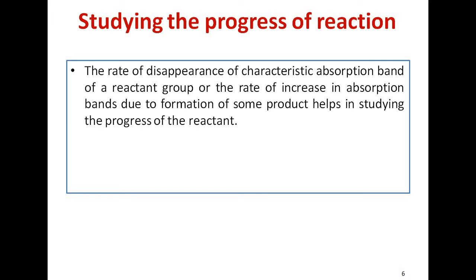For example, the gradual disappearance of the hydroxyl stretching frequency, which is obtained at 3600 to 3650 cm^-1, and the consequent appearance of the carbonyl stretching frequency, which is obtained at 1680 to 1760 cm^-1, can be used to study the oxidation of an alcohol to a carbonyl compound.